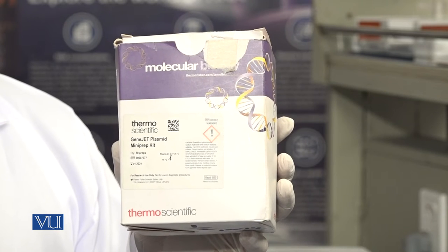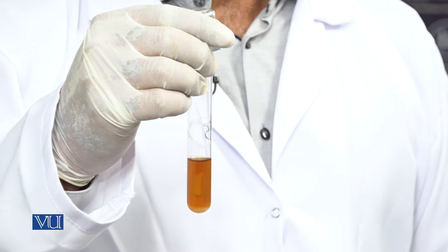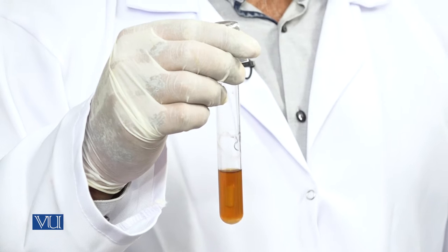This is the bacterial cell culture of E. coli which we prepared yesterday. We cultured it and it is now ready for use, and we will extract our plasmid DNA from this bacterial cell culture. For culturing E. coli in LB media, you can see our other video. Now we will take 1.5 ml of the cell culture, centrifuge it, pellet the bacterial cells, discard the supernatant LB media, and then proceed with these cells for plasmid DNA isolation.